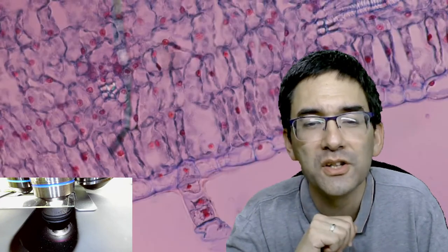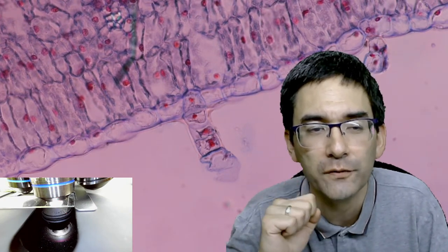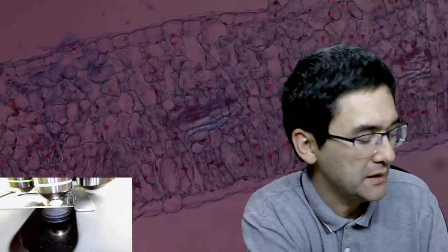To give an analogy - if you look at the throat, there are also cartilage rings that provide support and strength - it's basically a similar concept. These xylem cells can be quite long. I put some banana under the microscope some time ago and they also have long xylem. And look at this - on the bottom side here, you can see the surface of the top side of the leaf with those outgrowths - I wonder what function they perform.